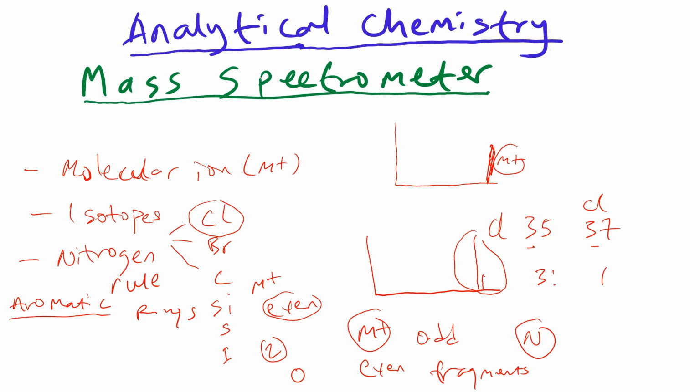They also usually have a common peak at M minus 1. Now this is M plus 1, right? So usually they'll have a prominent peak at M minus 1, like here is M minus 1. Here is M plus 1. So they usually have a prominent peak at M minus 1, and that is like a giveaway to know that this compound might be an aromatic compound.